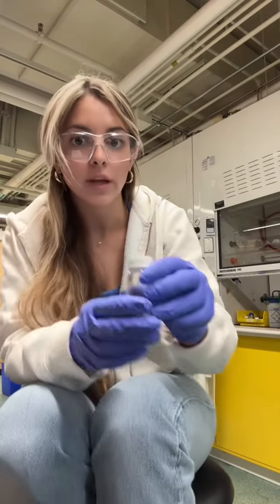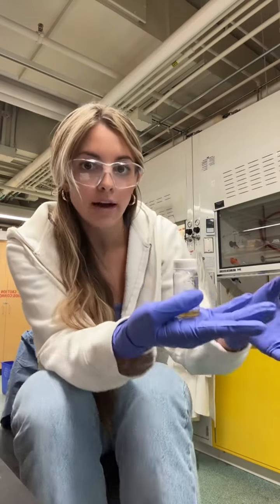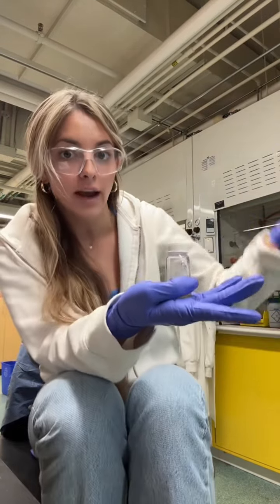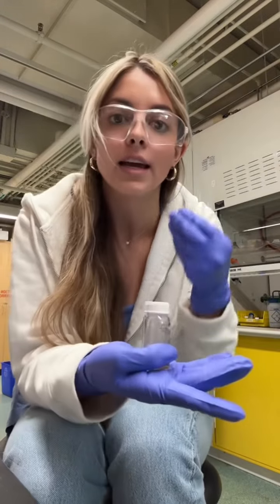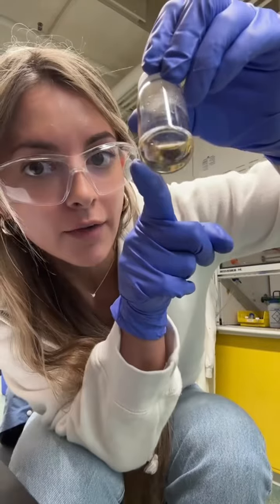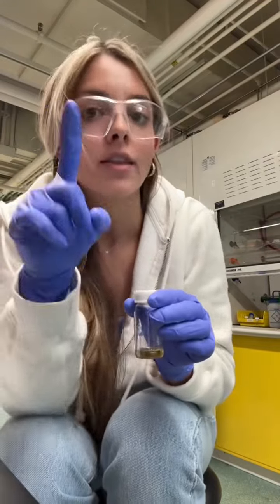But then you place this little vial in sand, for example, or in the fume hood. And over time, as the solvent evaporates, a certain concentration will be reached where that complex hopefully is insoluble, so that it would precipitate out of solution and you get a solid. But what exactly is this solid? This is the cool part.